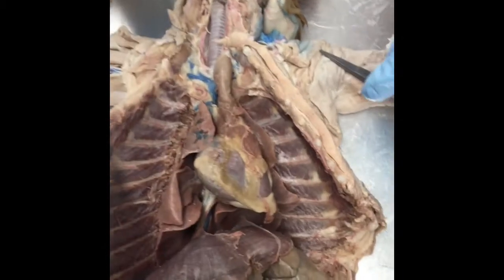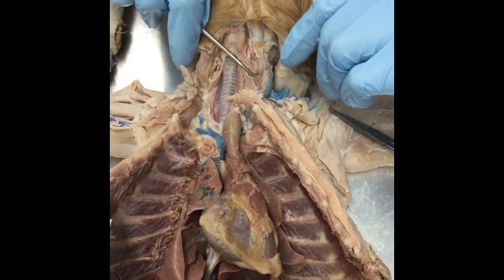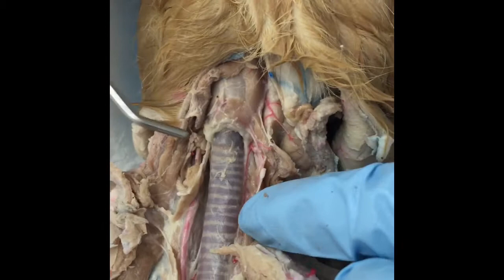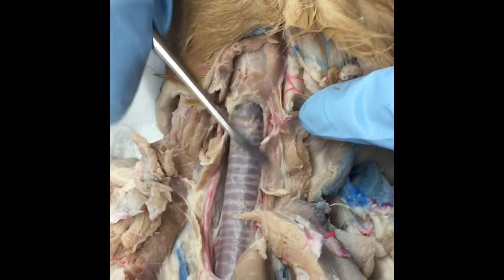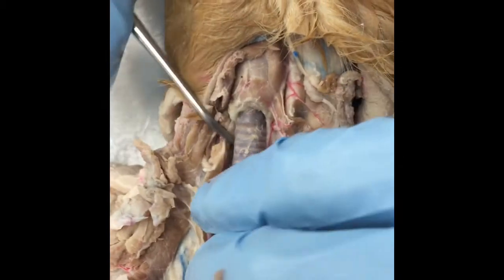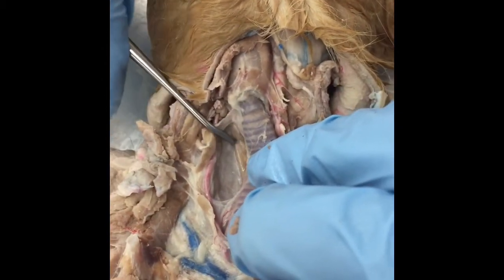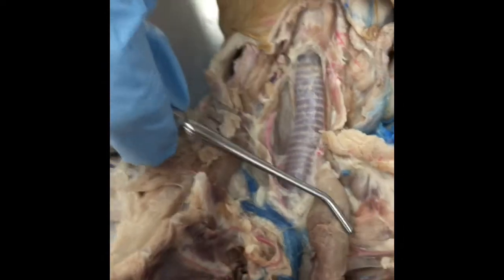So we have the trachea, this long tube. And then the thyroid gland is, we think, this portion right here, and the other side. And then underneath it, you can see the esophagus. And then we have the thymus.